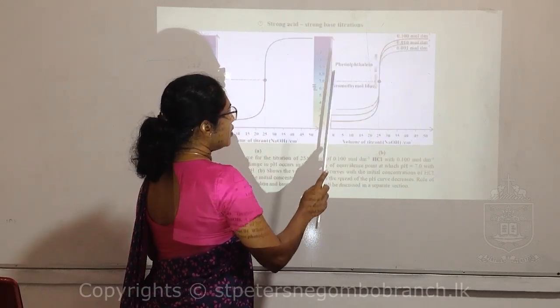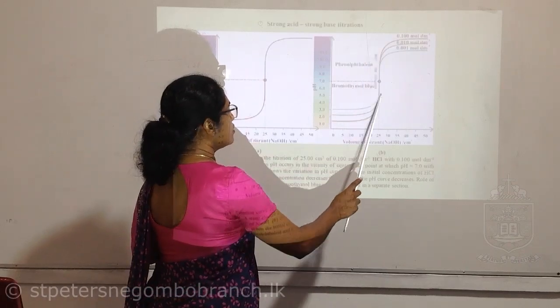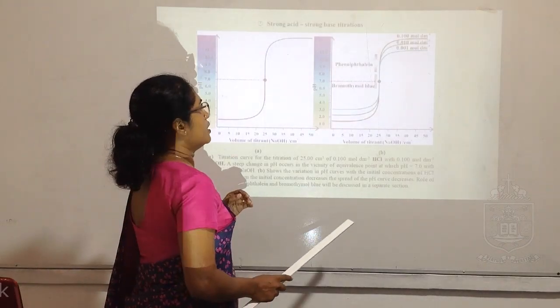And when we compare this curve carefully, we can find the spread of pH value decreases.